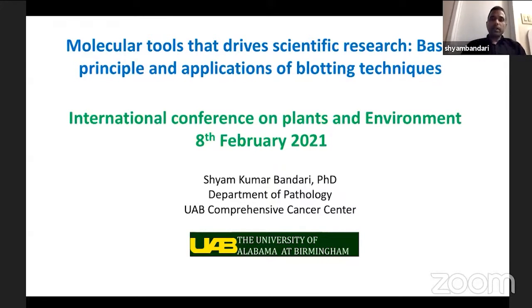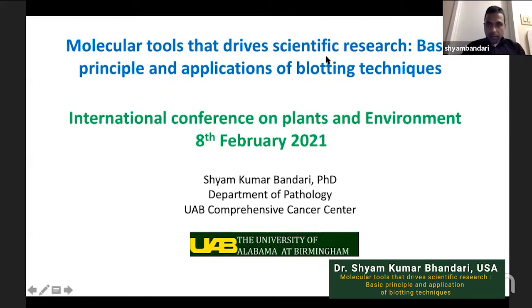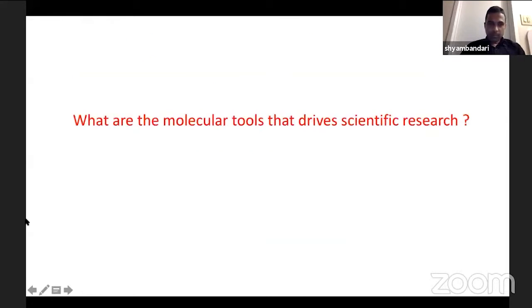So basically, the topic for today is molecular tools that drive scientific research and the basic principles and applications of blotting techniques. So what are the molecular tools that drive scientific research? Basically, there are some blotting techniques. These form the basics that drive all scientific research. Without these techniques, any molecular biology laboratory won't work properly. These techniques are essential to drive all scientific research.